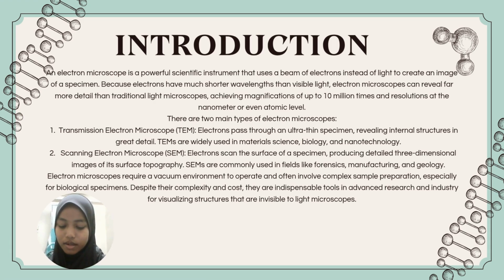Electron microscopes require a vacuum environment to operate and often involve complex sample preparation, especially for biological specimens. Despite their complexity and cost, they are indispensable tools in advanced research and industry for visualizing structures that are invisible to a light microscope.